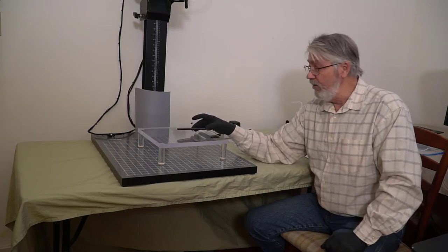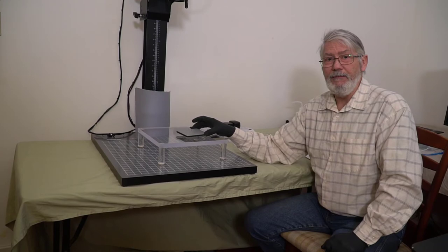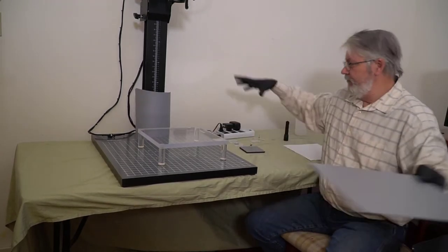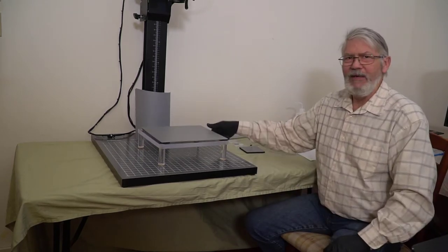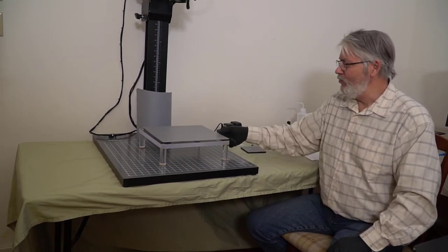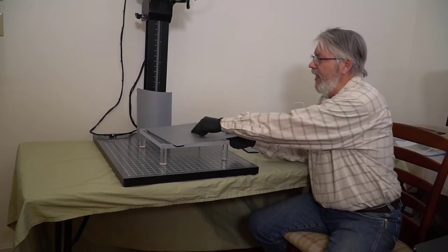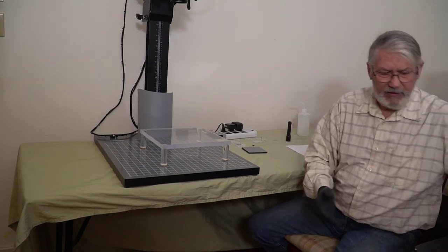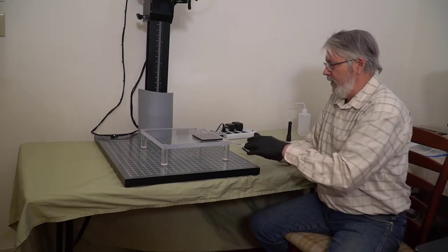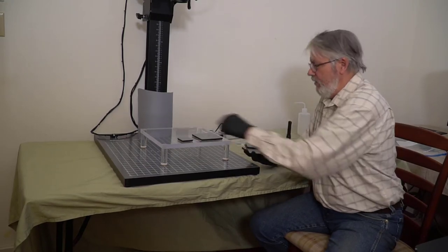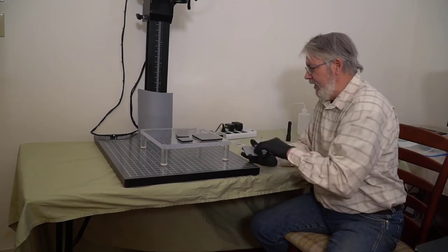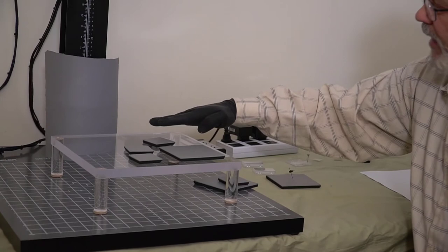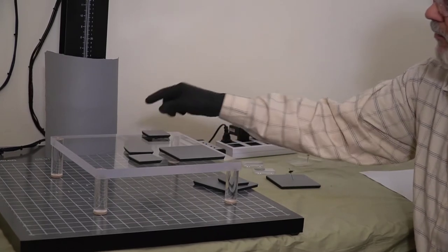This is an extremely accurate card because it's powder coated on aluminum. Unlike the cardboard cards that are commercially available, these don't deteriorate over time. If you have something really big like a giant lep, we make a big one. This has a little pad in the middle and four on the corners so you can pin to it. I'm giving you two of these four-inch pads and four even smaller ones. When you've got some really tiny stuff, you can pre-prep it, pin it in here, put it under your stereoscope, make sure it's absolutely level and put it aside. You can stack them up.